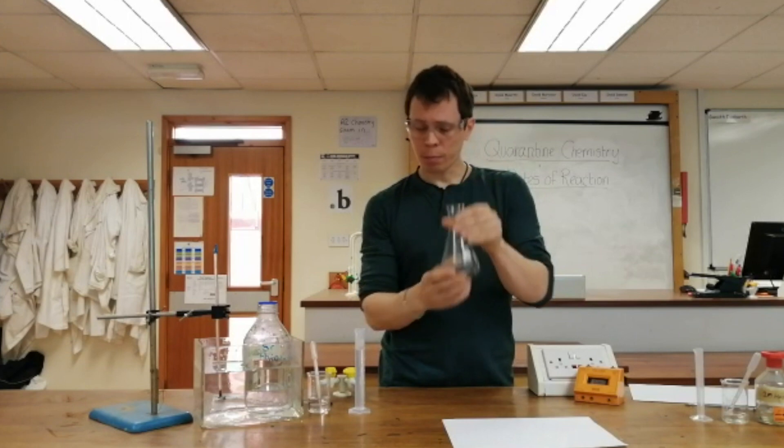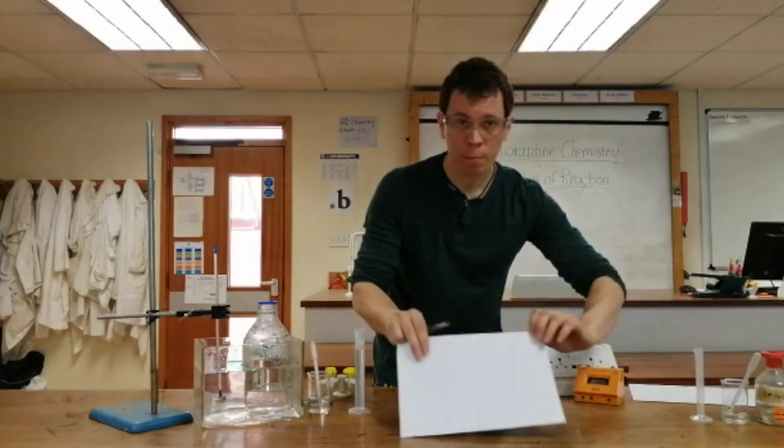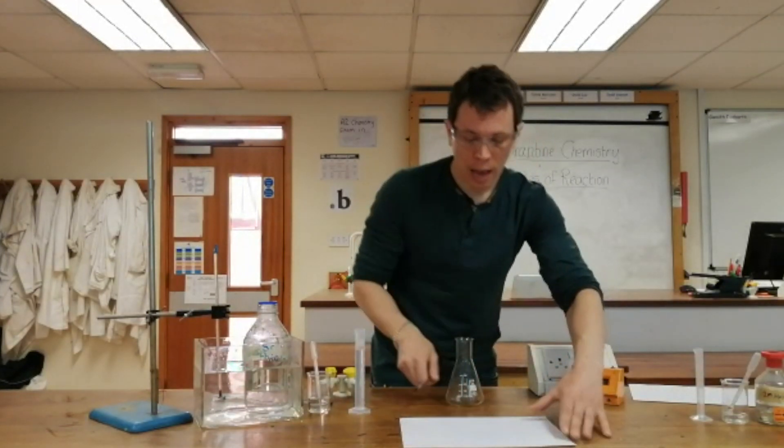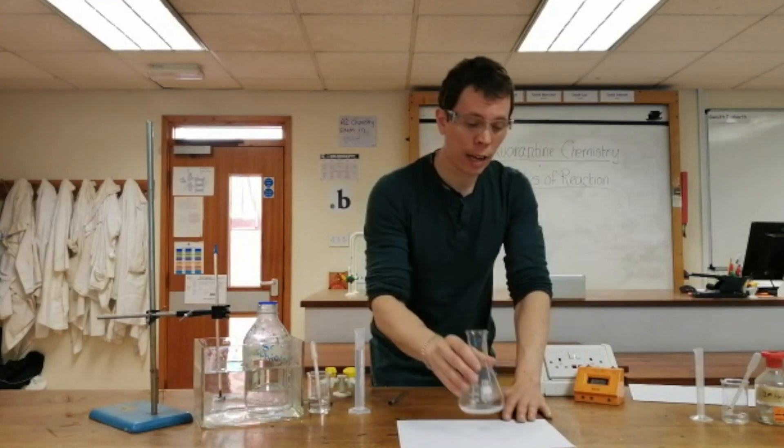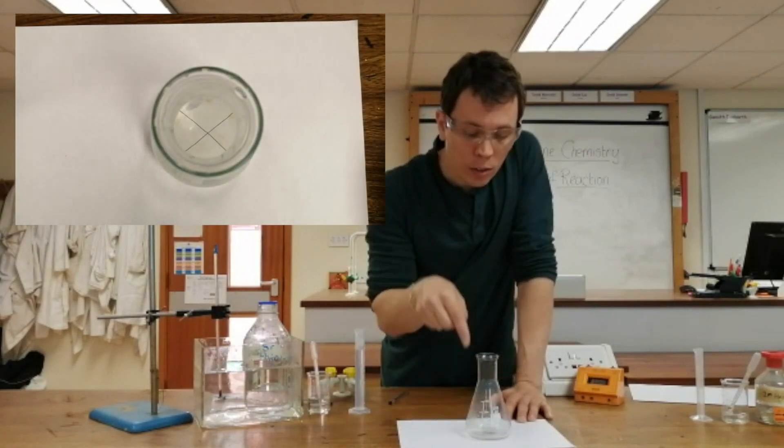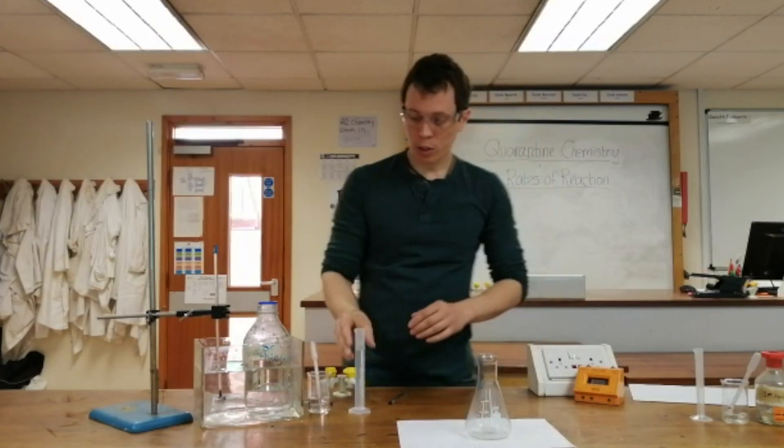I'm going to start by taking a plain piece of paper and drawing a cross in the center of it. I'm going to time how long it takes for my mixture to become so cloudy that I cannot see the cross through the mixture anymore. I have just measured out my 25 centimeters cubed of warm sodium thiosulfate.